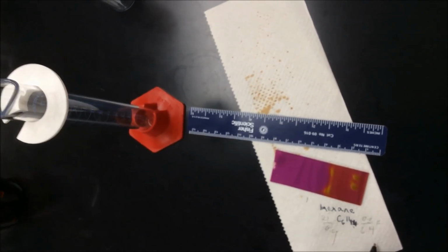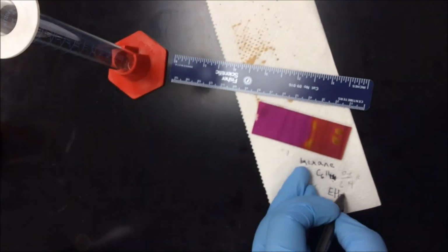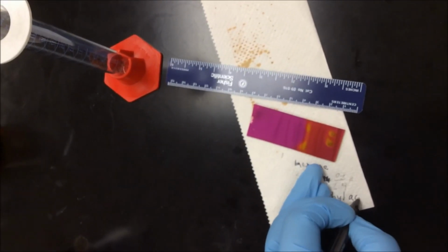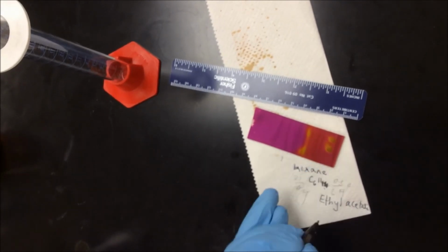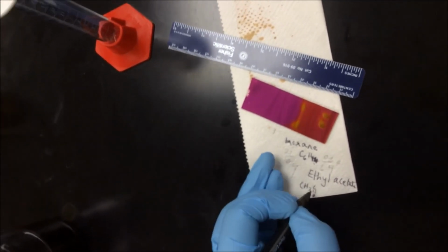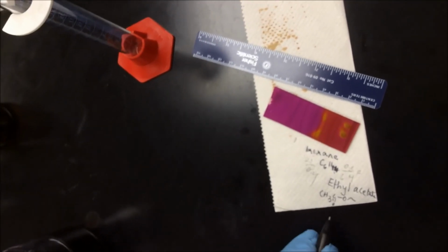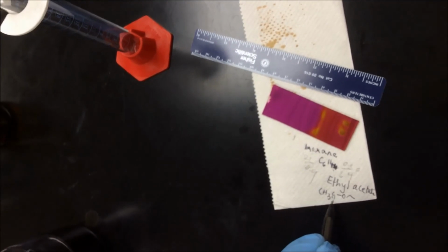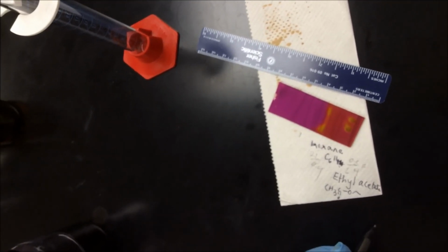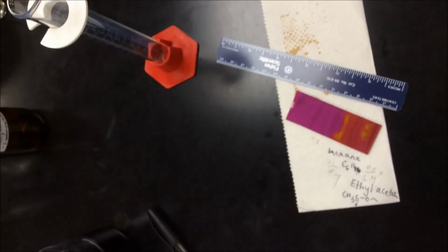RF? Alternatively, if you were to run this in ethyl acetate, which is a polar solvent, CH3, C double bond O, C2H5, how do you think the polarity is going to change in that case? I want you to mull over that while I set up the column for the column chromatography.